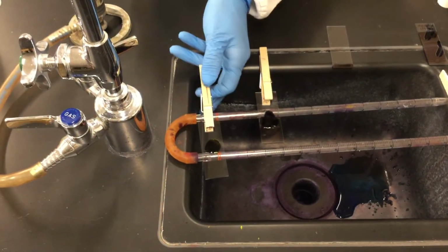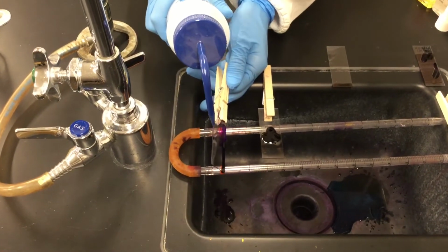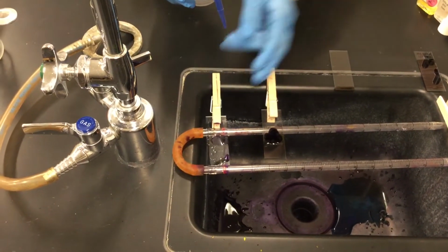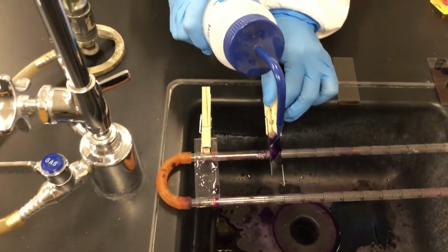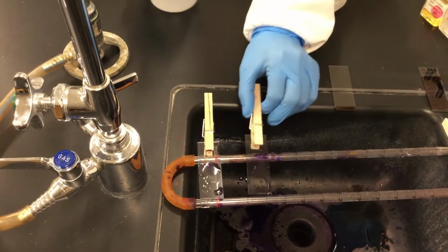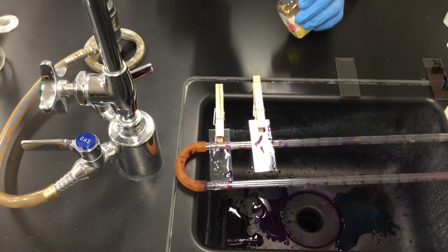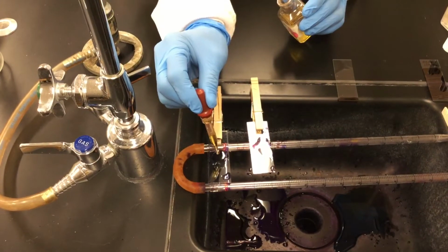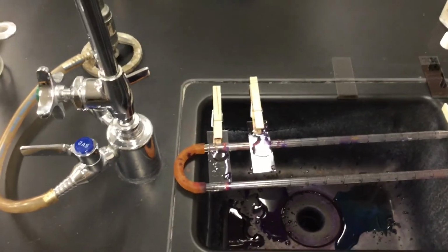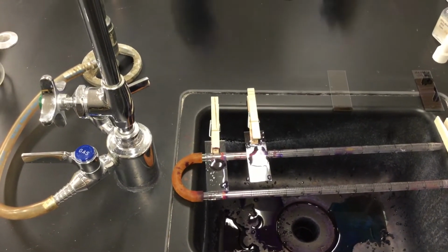Okay, so after that minute, you rinse it, and then you do it like this, putting your slide sideways. And make sure that you don't have any dye left. Then you add your fixative agent. Again, 1 minute.